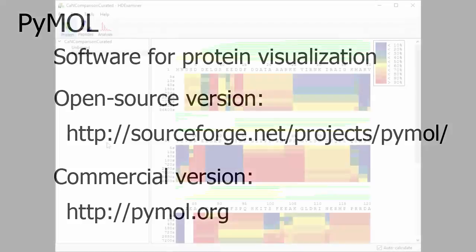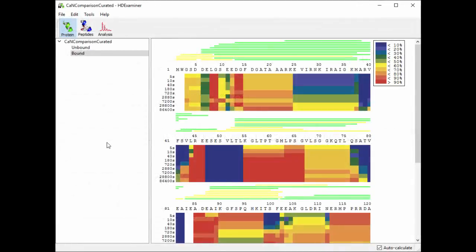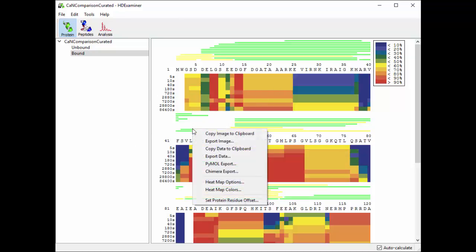Now what HD Examiner can do is it can take a heat map like the one I'm showing here and export a row of that heat map that you can embed onto your protein directly in PyMOL. So to do that, you can right-click on HD Examiner's heat map and select PyMOL export.